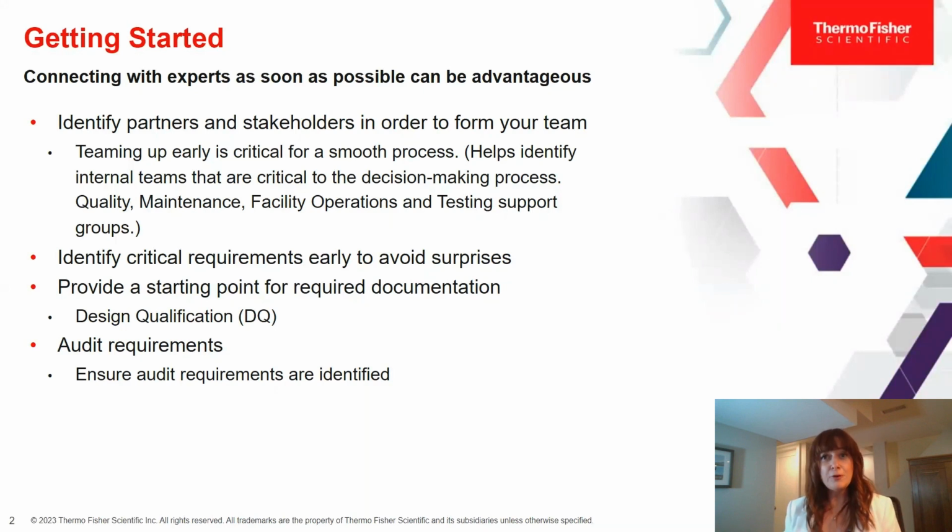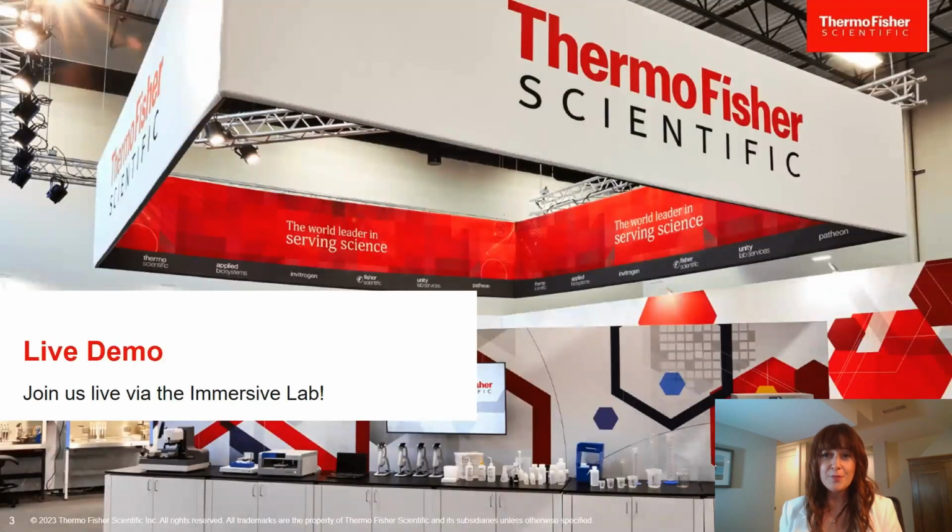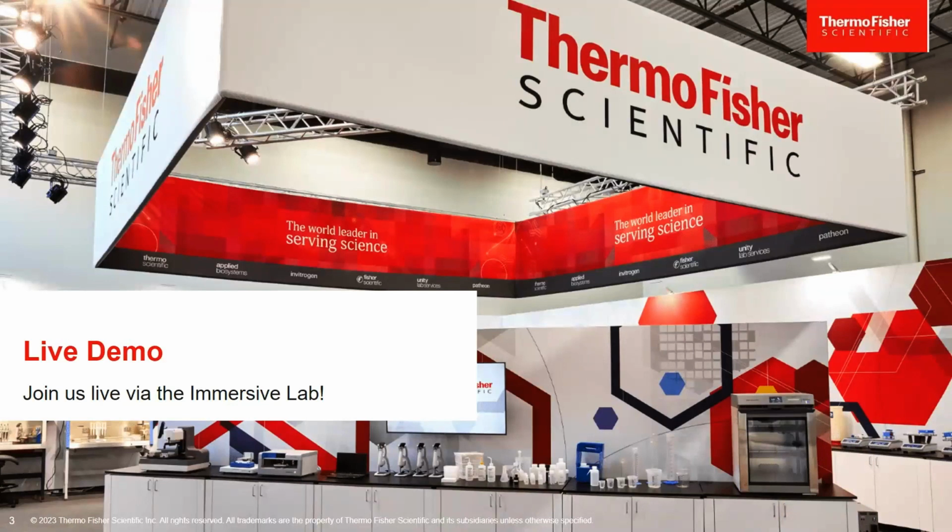And this can be helpful in aligning your project to business strategies within your group, whether it's your research group or your production group. It can help with efficient operations. It can help manage quality expectations. It can help with facility and maintenance requirements, and also testing and validation requirements. So we're going to walk through these steps, and I'm going to welcome the Immersive Lab on camera here. So welcome to the team in the Immersive Lab.